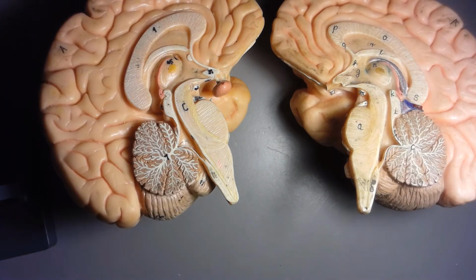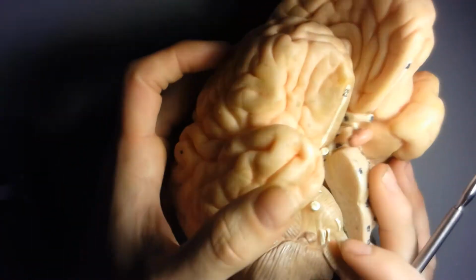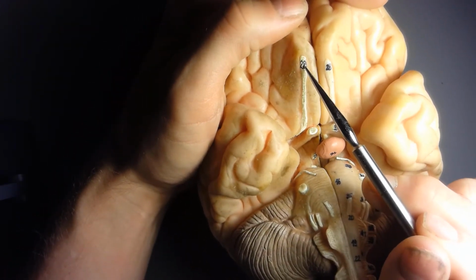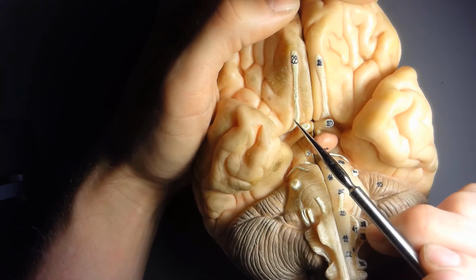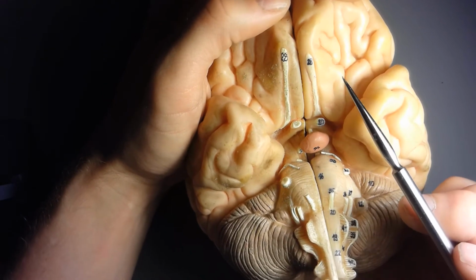You've got the olfactory bulbs. I'm going to put this brain together here. So once I put the brain together, these are the olfactory bulbs. And what's connected to the olfactory bulbs are the olfactory tracts, which is the long neck of the olfactory nerve.